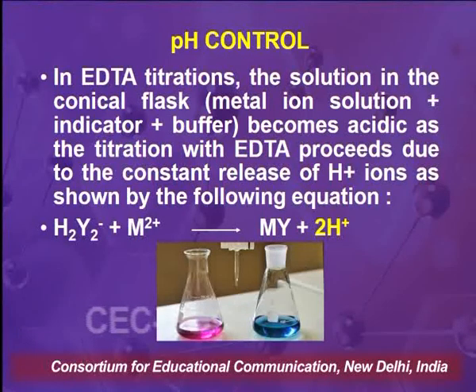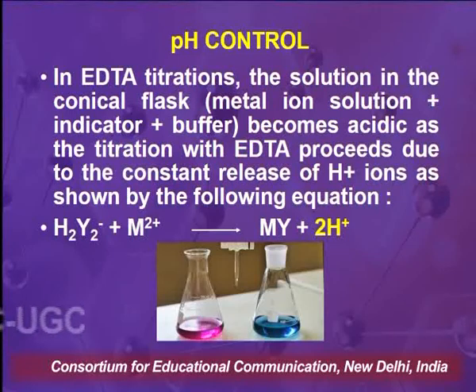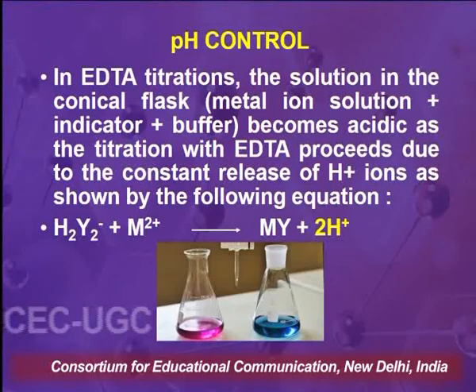It reacts with a dipositive metal ion, which can be magnesium, zinc or any other metal ion which can be estimated by complexometry. Upon the reaction, MY, that is a metal EDTA complex, is formed and protons or H+ ions are continuously released in the solution. And as we know, the release of protons results in the increase of the acidity of the solution, or a consequent decrease in the pH of the solution.